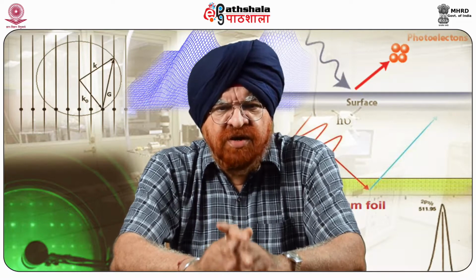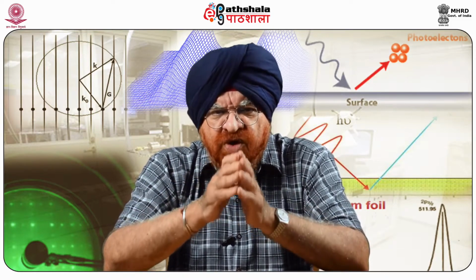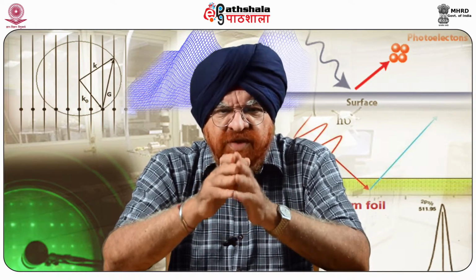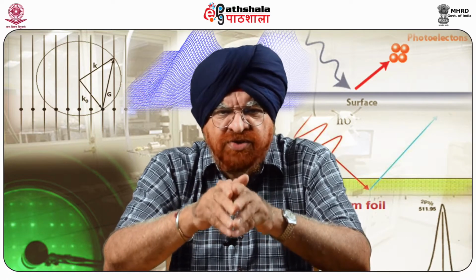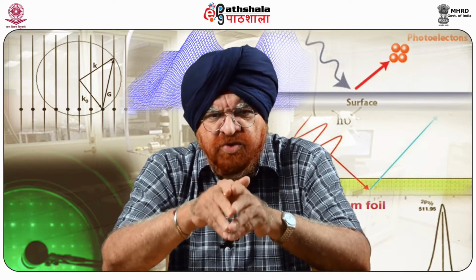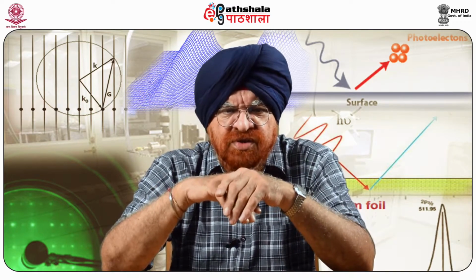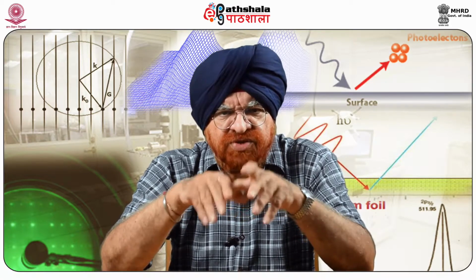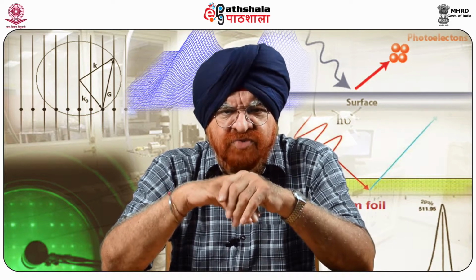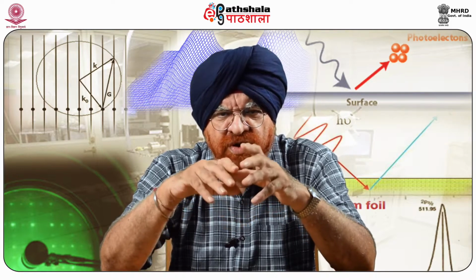So students, having learned about CFM from various points of view, like the historical background, the principle behind this, and the instrumentation part, let's summarize what you have understood from this module. CFM imaging can find many uses in basic and applied research, from quantifying the strength of interactions in host-guest systems to identifying surface distribution of chemical modifications or chemically distinct domains in soft materials such as copolymers. A wide range of intermolecular interactions can be studied by this technique, and analysis of these data can provide basic thermodynamic information relevant to chemical, biological, polymer, or colloidal systems.